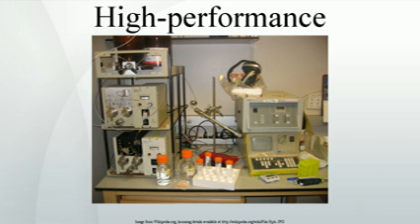Retention factor, kappa prime, measures how long a component of the mixture stuck to the column, measured by the area under the curve of its peak in a chromatogram, since HPLC chromatograms are a function of time. Each chromatogram peak will have its own retention factor, for example kappa 1 for the retention factor of the first peak. This factor may be corrected for by the void volume of the column.